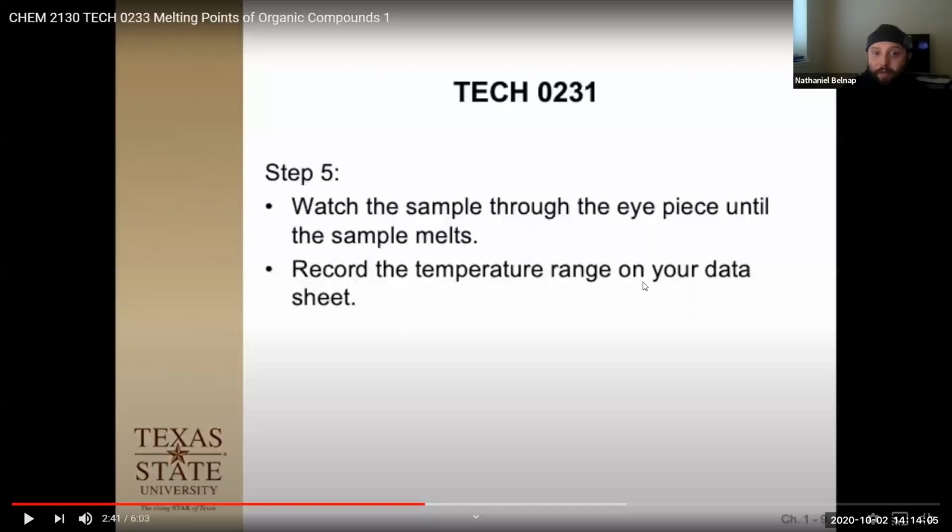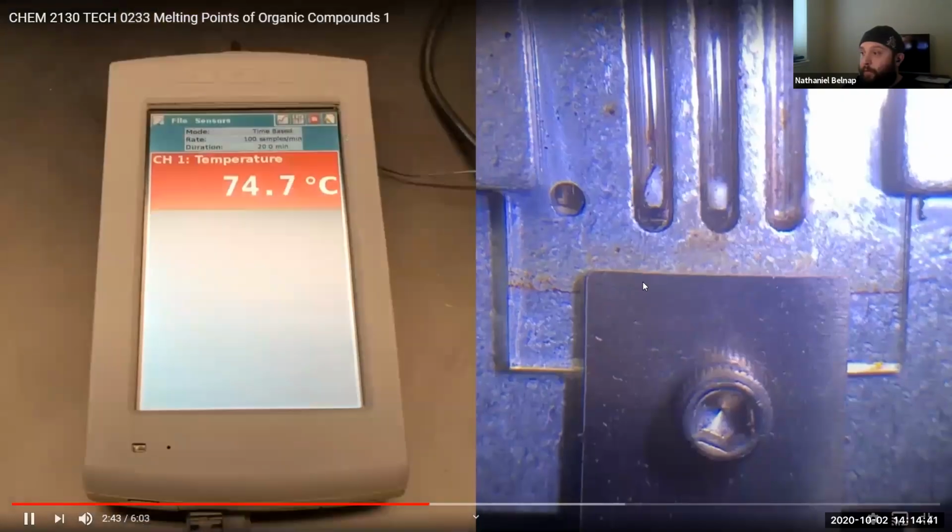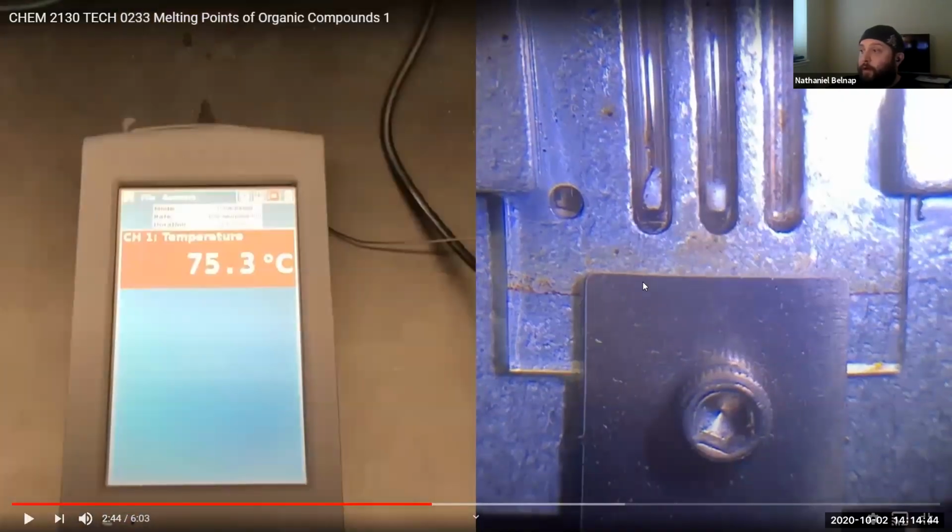So I'm guessing this is the only data you guys are going to have to record, the actual melting range. Does anyone want to volunteer to tell me stop when it starts melting, and then tell me stop again when it's done melting? Okay, Christine? I can do it. All right, cool. Just keep your mic on so you can tell me, because it happens pretty quickly. Before we start, you're looking at the one on the far left.